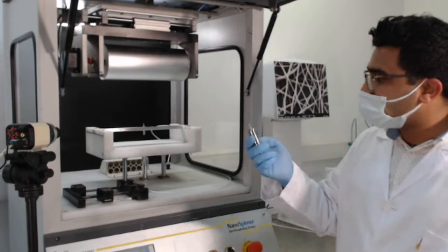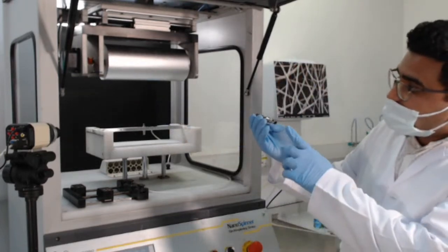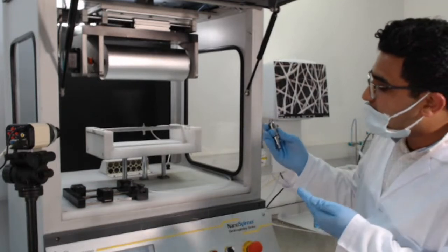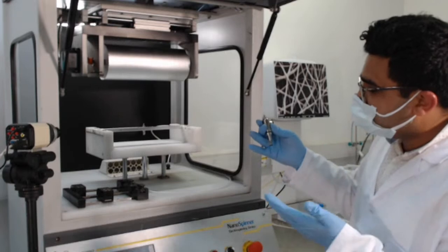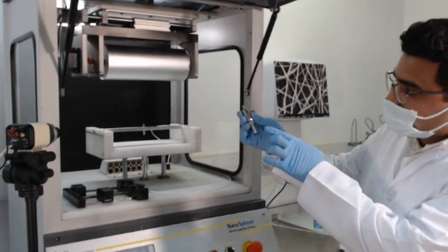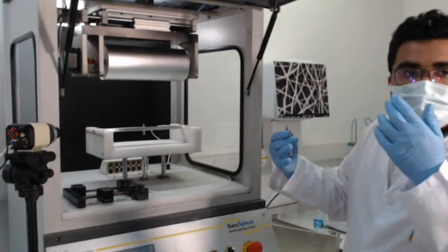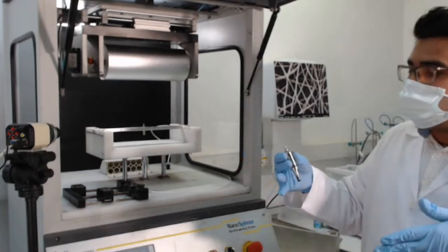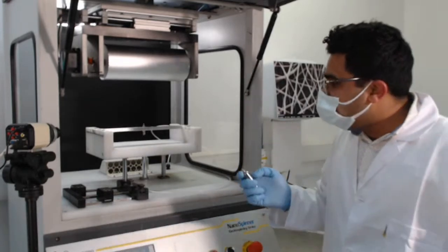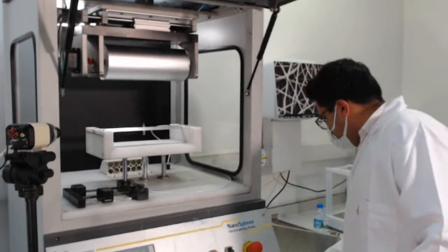This is the coaxial nozzle. It can be attached similarly, but it has two inlets, one here and one here. This nozzle is for the purpose of producing composite nanofibers. Suppose that you want two different solutions being spread. It will basically produce a fiber within another fiber, essentially. This is one other thing that you can use in our machine.